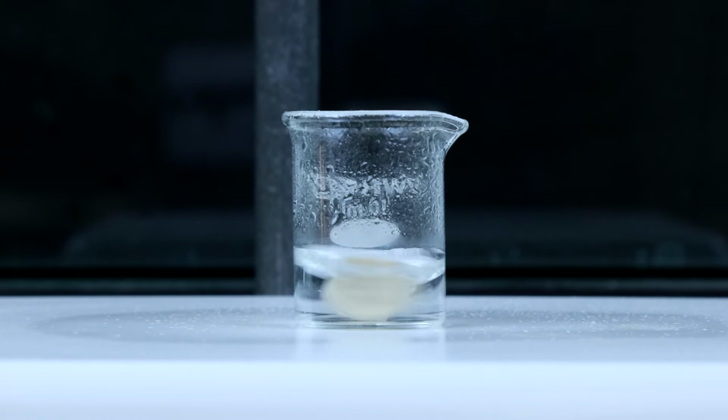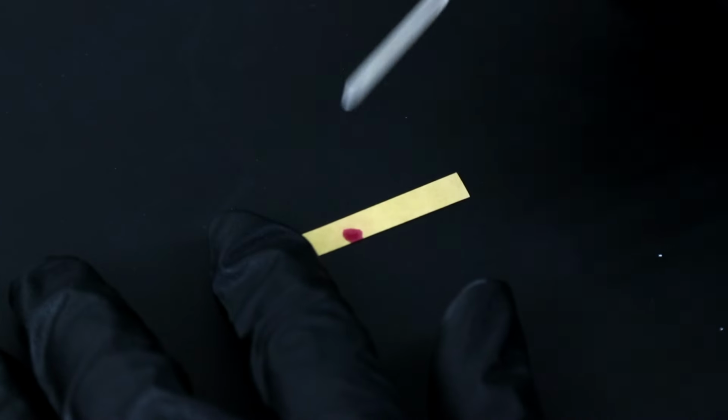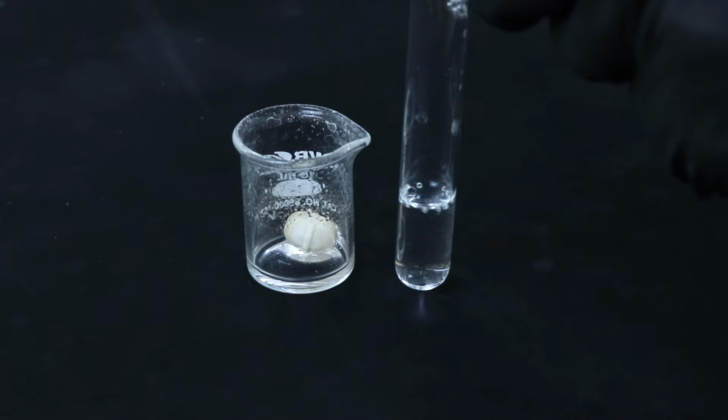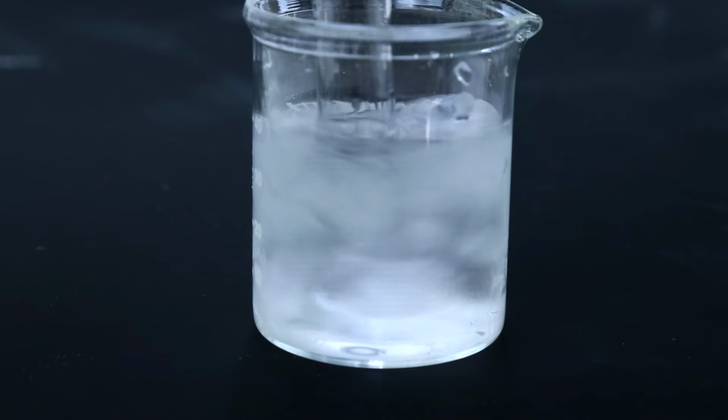And I have yet to see any precipitate form, so this unknown acid has got to be very soluble in water. If the solution remains acidic and no precipitate has formed, I'll have to put it in an ice bath to try and get the product to come out of that solution. And it is still acidic, so I'm going to go ahead and transfer the solution to a test tube now and place it in an ice bath to see if I can get that unknown acid to come out.